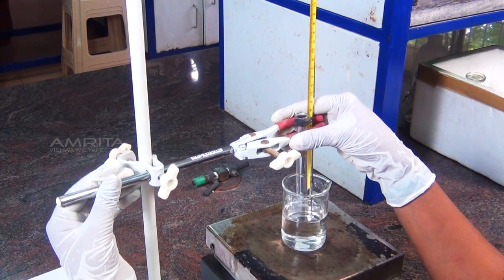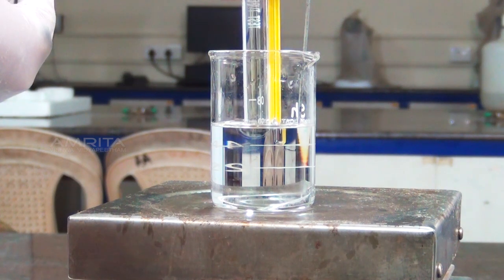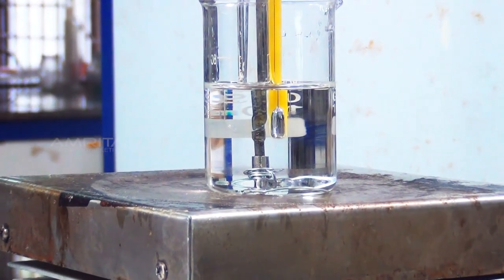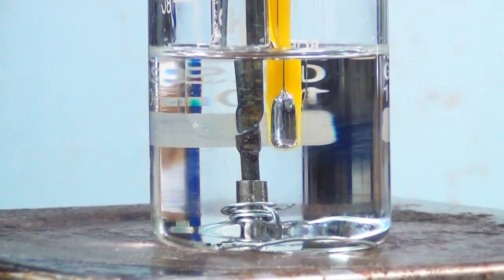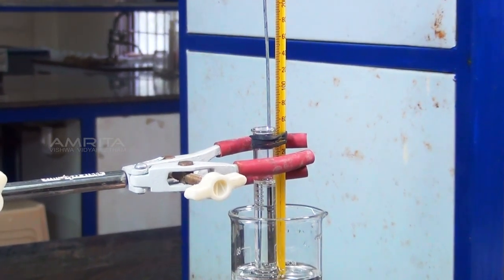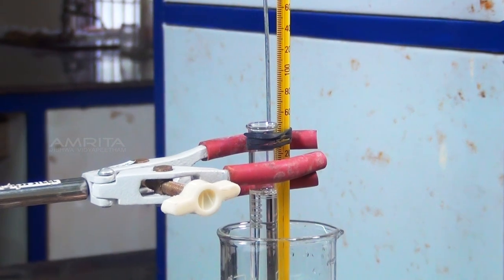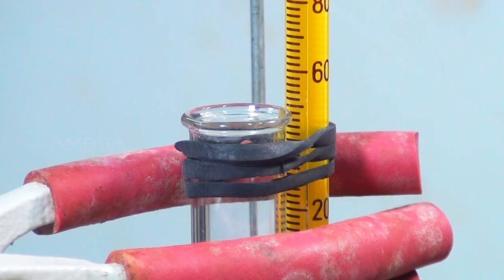Lower the thermometer along with the test tube into the liquid paraffin bath. Adjust the setup so that the thermometer bulb is well under the liquid paraffin bath and the open end of the test tube with the rubber band is sufficiently outside the liquid paraffin bath.